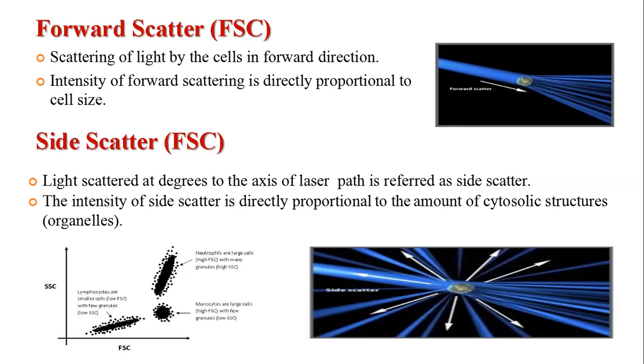Now FACS, or fluorescence activated cell sorter, using lymphocytes, monocytes, and neutrophils. I'm taking a mixture of blood cells and tagging them with a fluorescence probe conjugated antibody. Now I'm getting three different populations here. This is forward scattering along the x-axis, and on the y-axis there is side scattering.